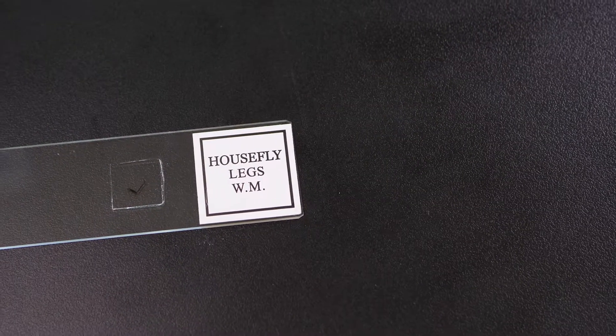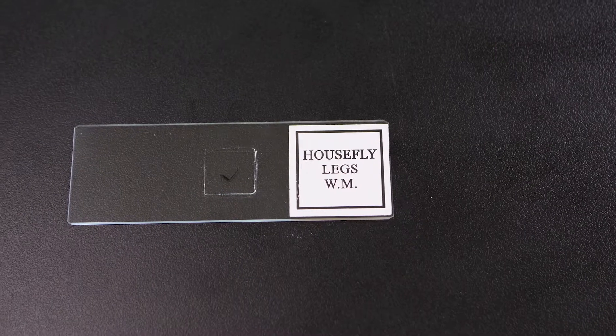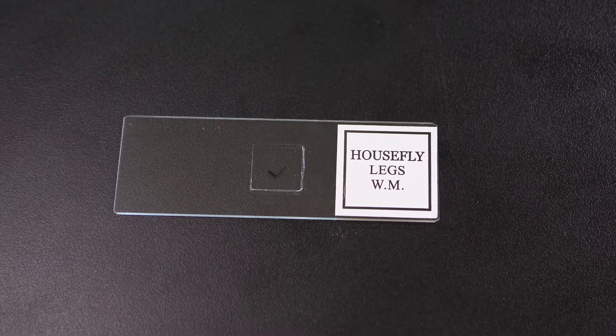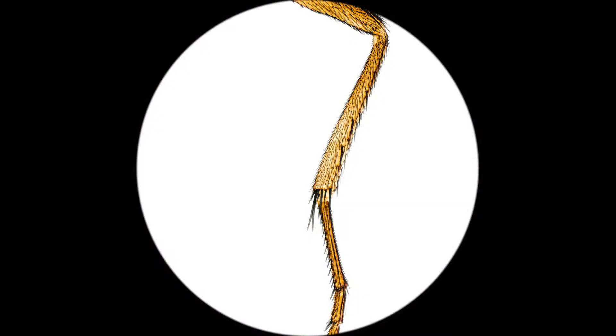Larger or thicker objects can be examined with a compound microscope without being sliced, but we may only see the outline of the specimen and some of its surface details. This is a view of a housefly's leg with the scanning objective lens of a compound microscope. This is the same specimen at a higher magnification.